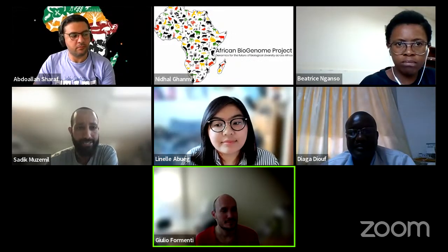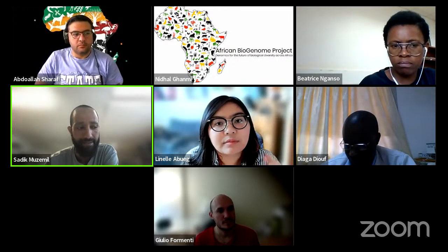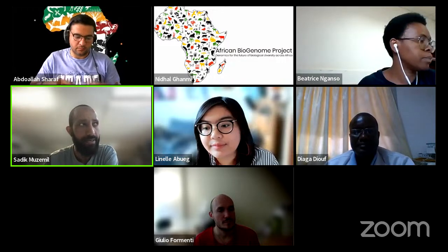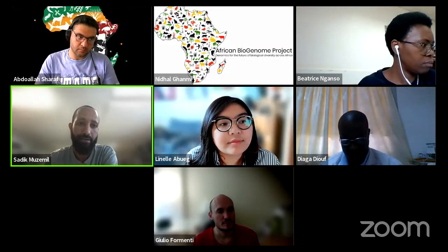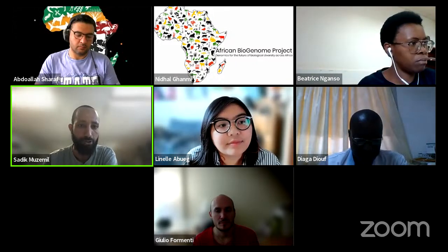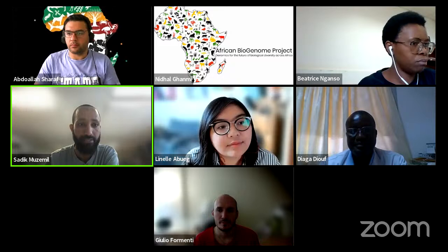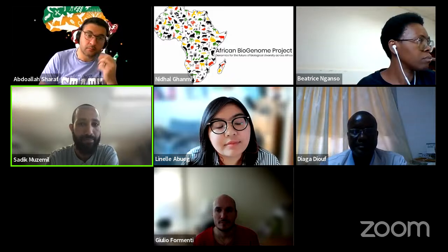I'm quite interested in the purging step particularly. HiFiASM does have the purging parameter, from light to several levels of purging, but it's not clear what that would mean. I'm curious to know whether you're just generating the default HiFiASM and then running purge_dups on each of the primary and the alternate assembly, or whether you're playing around with those parameters, like the purging, or the similarity or k-mer value, and how you are dealing with this when you are fine tuning your assembly before further cleaning up the assembly?